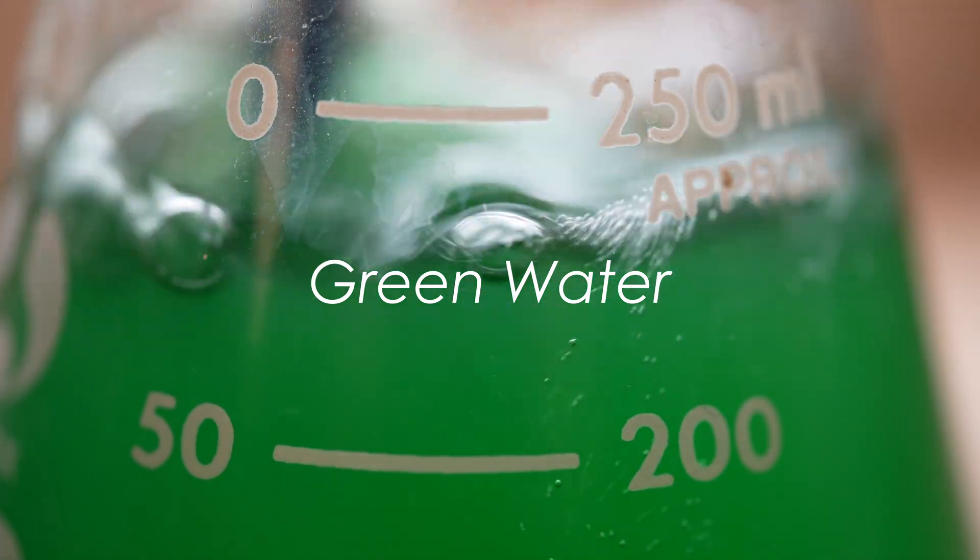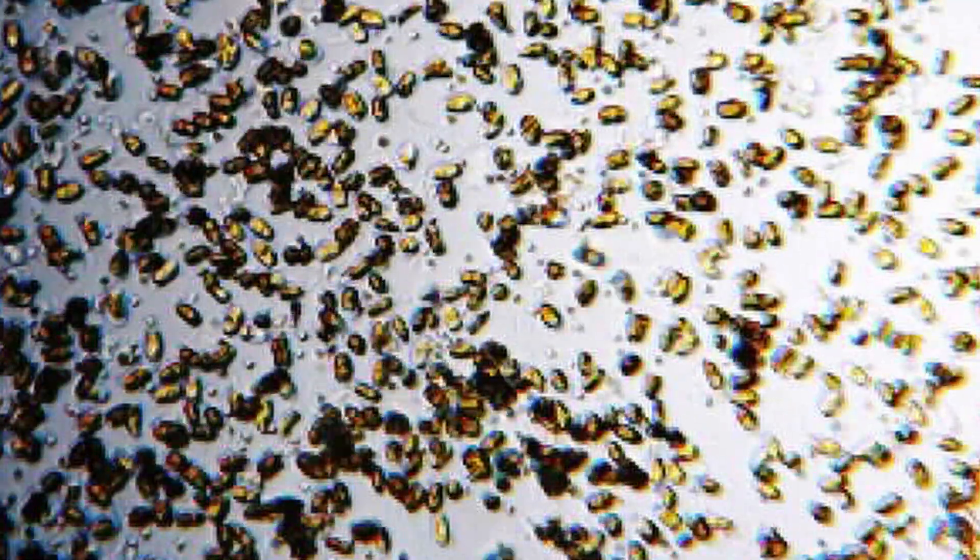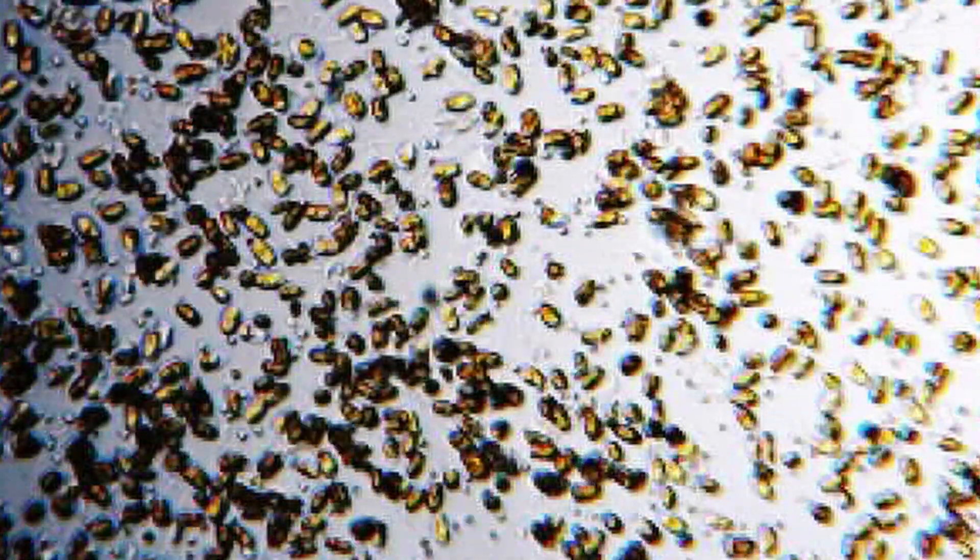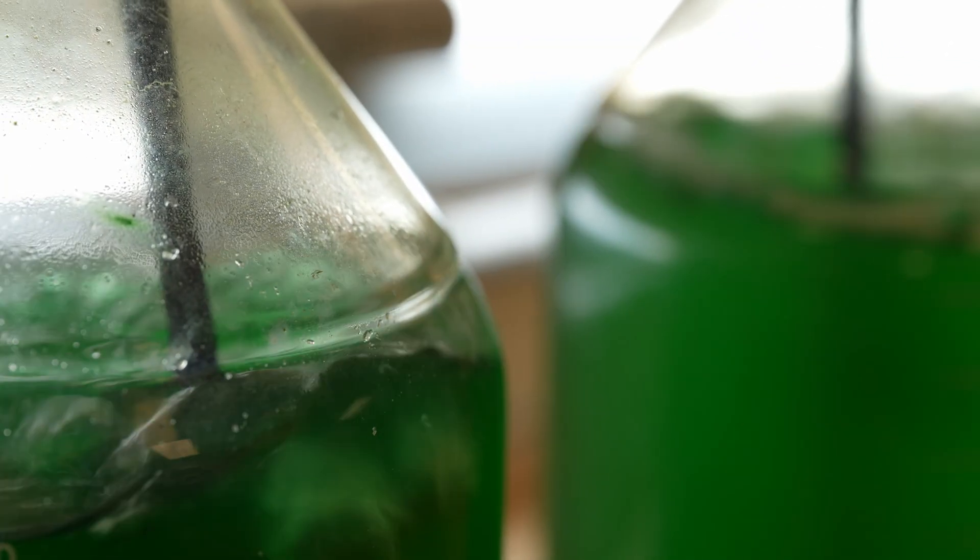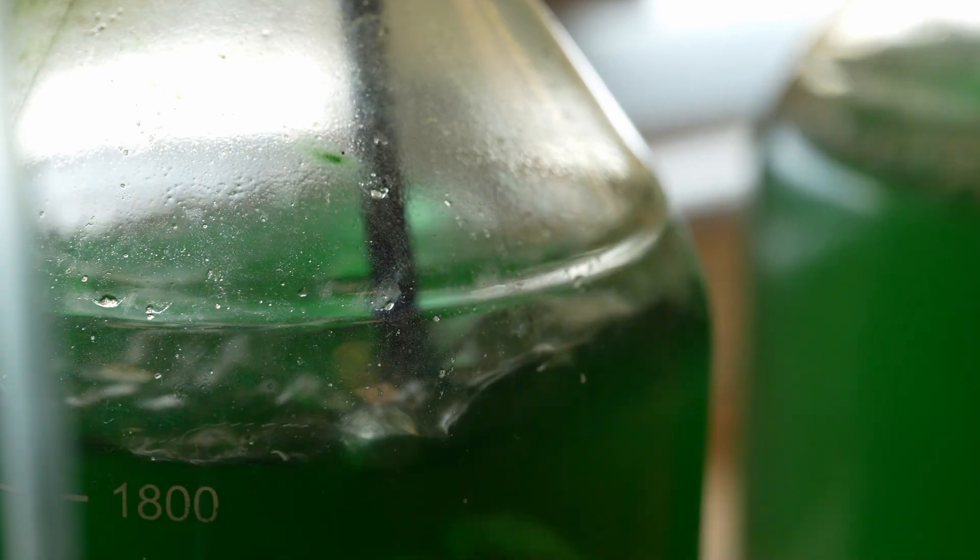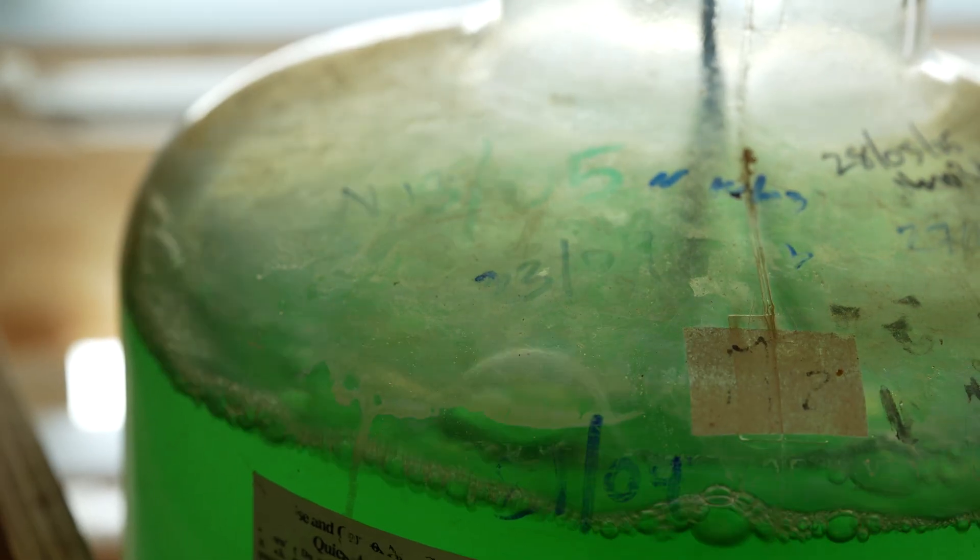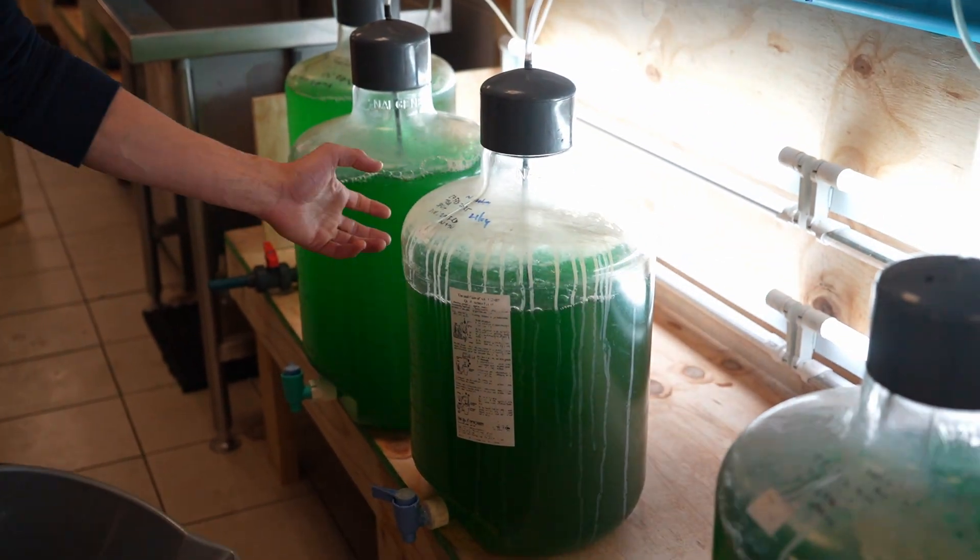So this is our green water. And we use this as our food. This is one of the things that we culture here. The green water is basically an algae or phytoplankton. You naturally find it in the ocean just scattered throughout. We just grow it here in quite heavy concentrations. Basically every morning we're going to come and select from all the algae that we have and pick the darkest ones because that's obviously the most dense. Looking at it quickly, it looks like this one's the darkest.